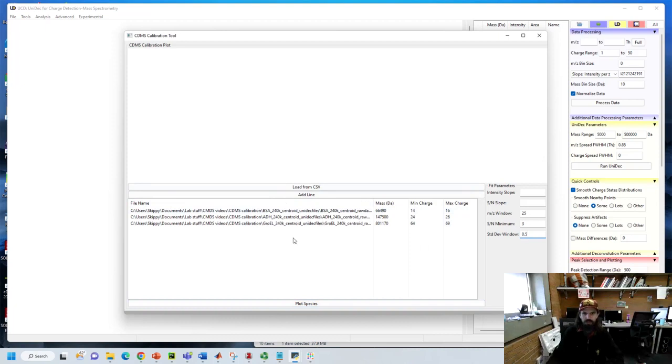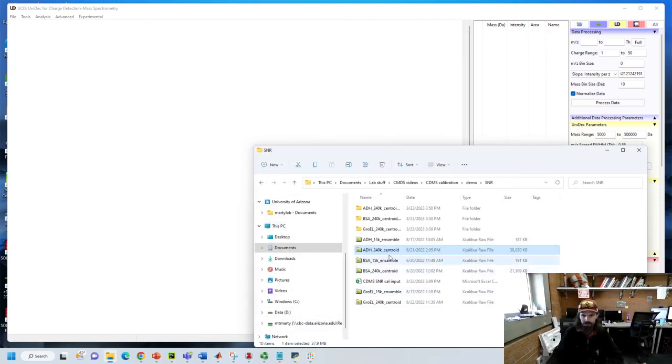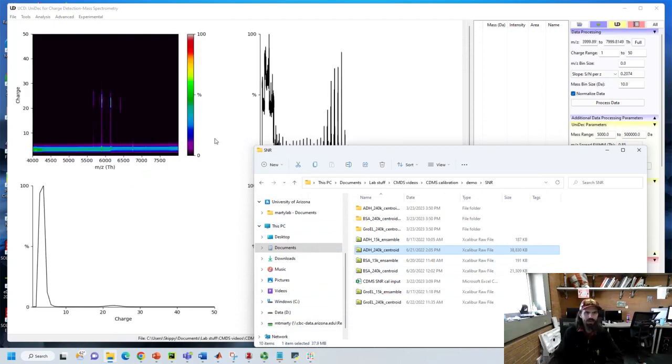The one thing that I will also point out is that, instead of those .dmt files that we got from Storyboard, we have these .npz files. Really briefly, what I did previous to starting this video is I processed all of our centroid data just directly from the raw files in UniDec. I'll just demonstrate that right here. All I did was drag it and drop it in here. I didn't do any additional filtering. Obviously this is all pretty messy here. We would adjust a lot of settings and try to clean this up, which we could do.